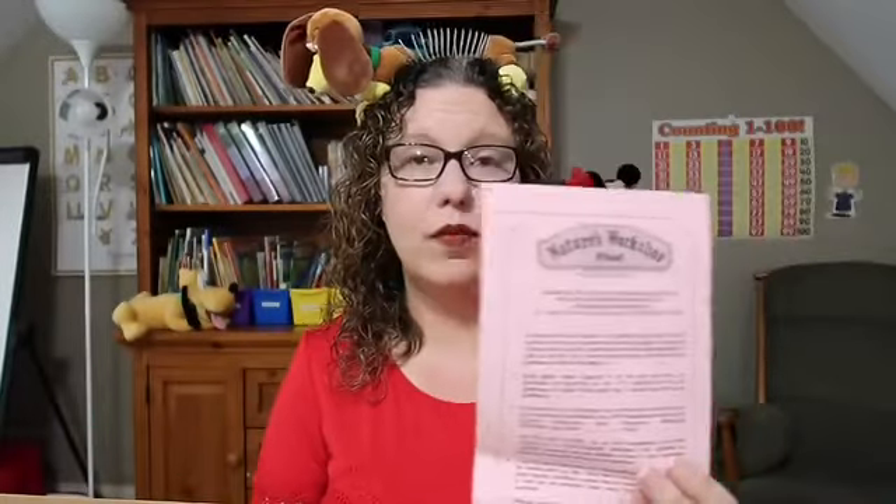So you've got your dissecting pan and pad, instructions on how to handle and store your specimens, and a full inventory list. The list includes: the pan and flex pad, a plastic tool case with stainless steel scissors, a chrome probe, a six-inch plastic ruler, ten dissecting pins, a cartilage knife (heavy-duty scalpel), a second scalpel, a three-inch glass dropper, a straight teasing needle, a curved teasing needle, and the set of four specimens — an earthworm, a frog, a perch fish, and a crayfish.